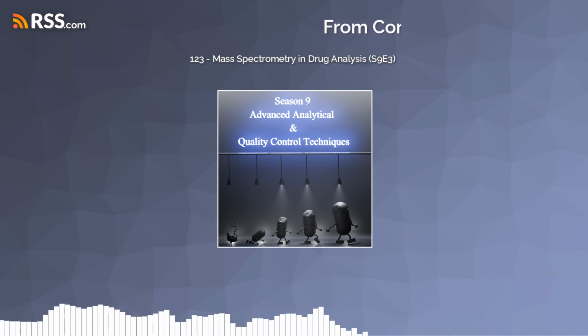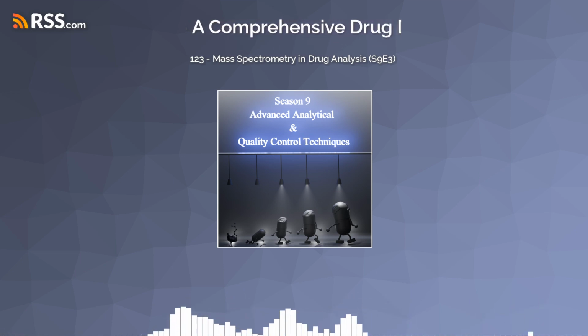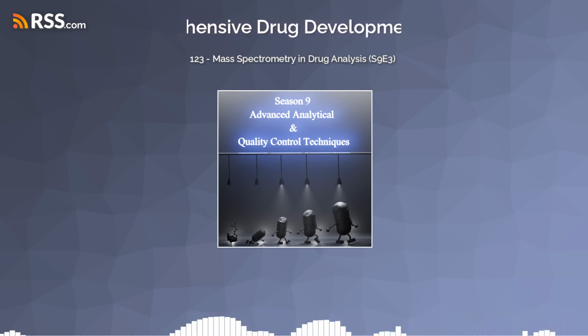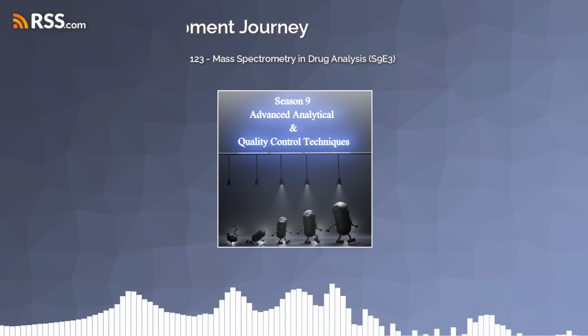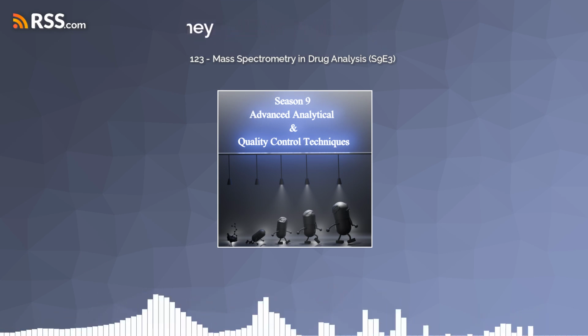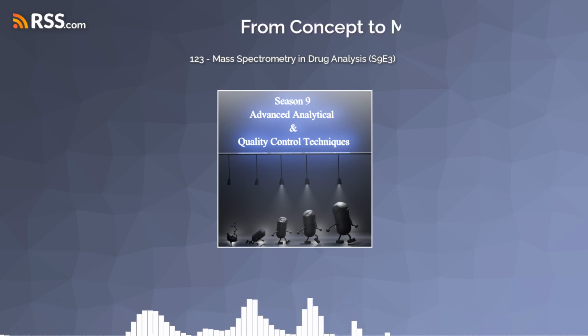What about sensitivity? Think of it like this. You're searching for a single specific grain of sand on a massive beach. A highly sensitive mass spectrometer is like having a detector that can zero in on that one grain of sand, even among millions of others. So it's about being able to detect even tiny, tiny amounts of something. And as we said, even trace amounts of impurities can be a big deal.